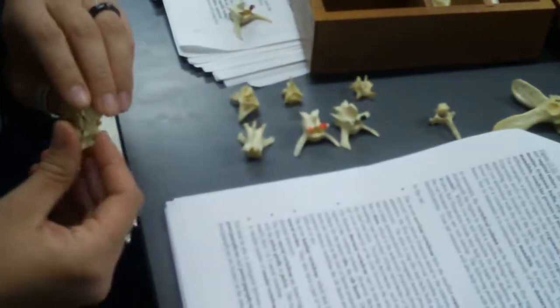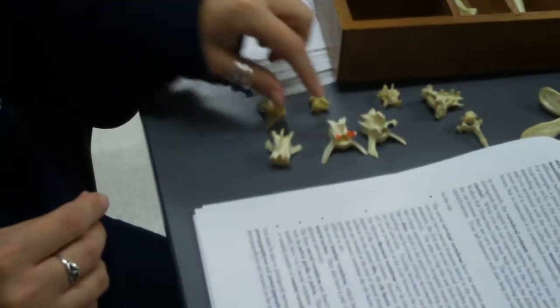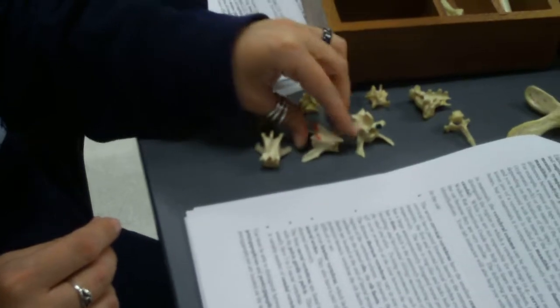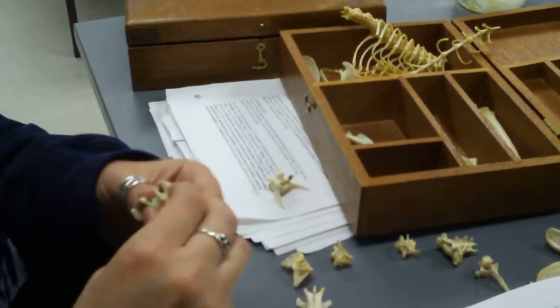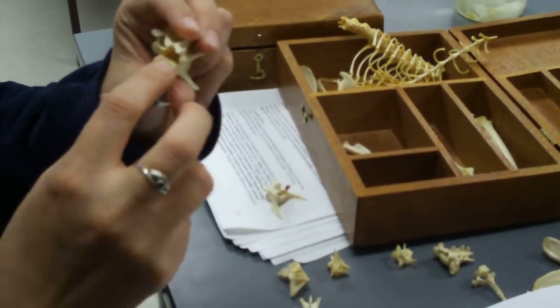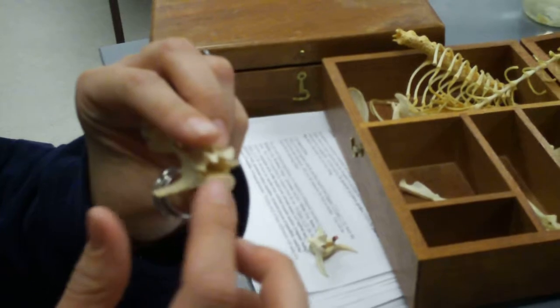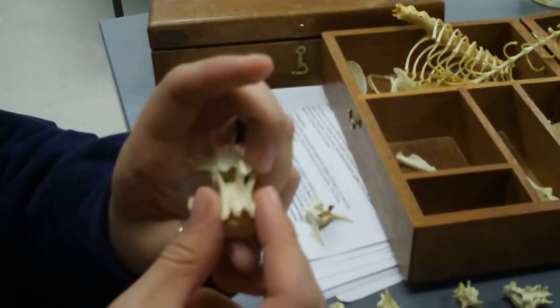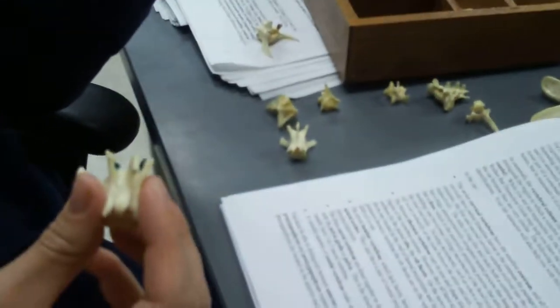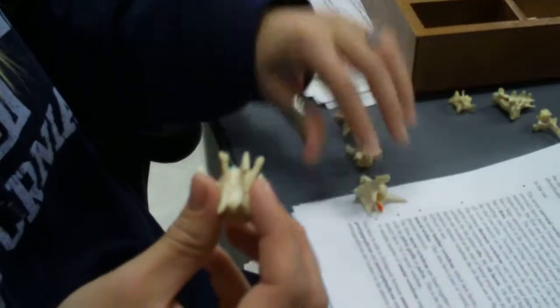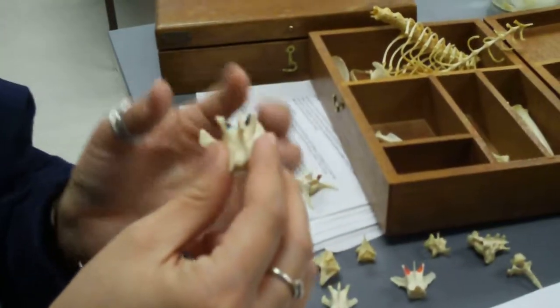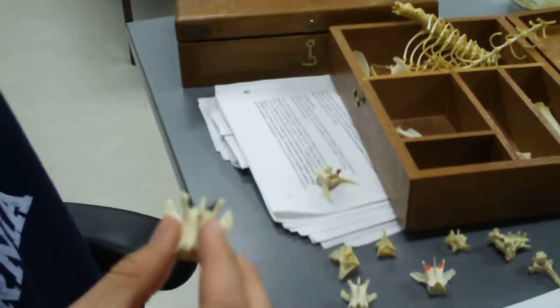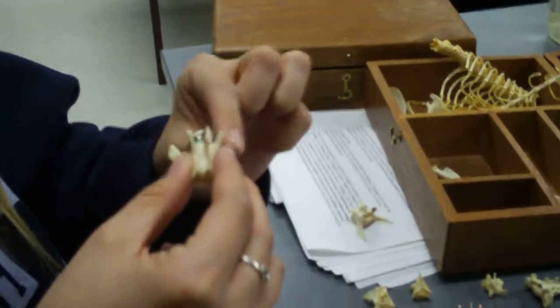Sacral vertebrae. Lumbar vertebrae. These guys are lumbar vertebrae, and they have the largest centrum, which is this big round part right here. And they also have transverse processes, which stick off and go anteriorly, so towards the head. These are the transverse processes.